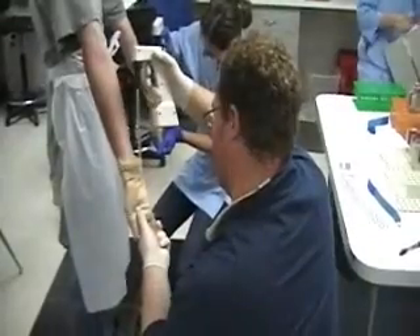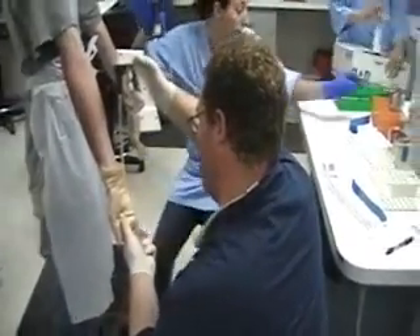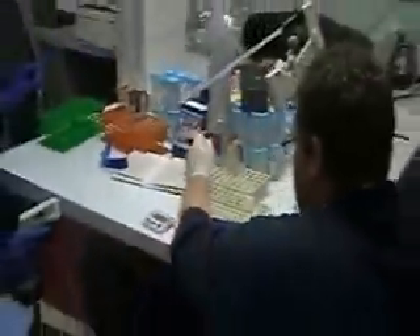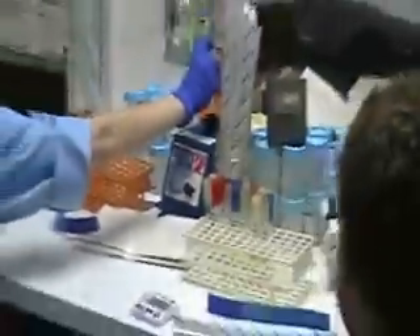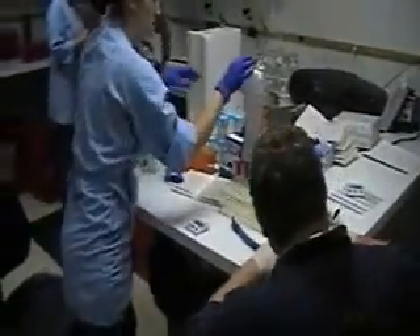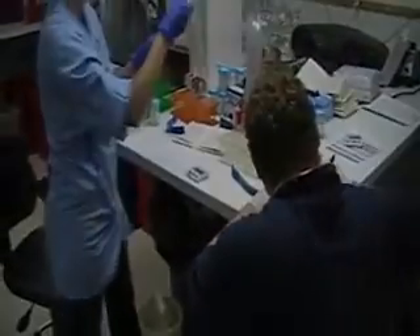Samples are then taken, put into the tube, and stored. Vortex. And that is the glove juice procedure.